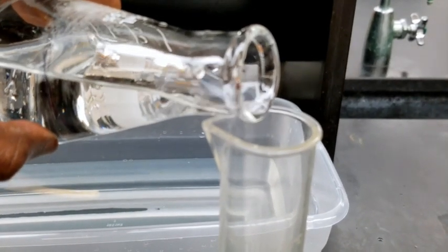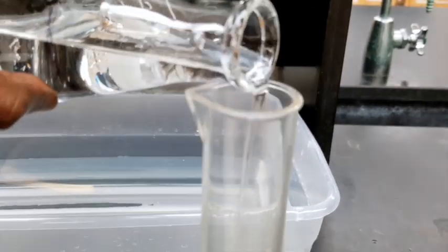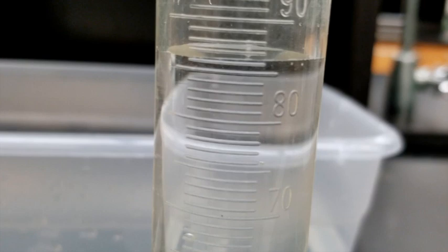If you think about it, the volume of the water you just measured is the same as the volume of the gas that was in the Erlenmeyer flask before you removed it from the trough.